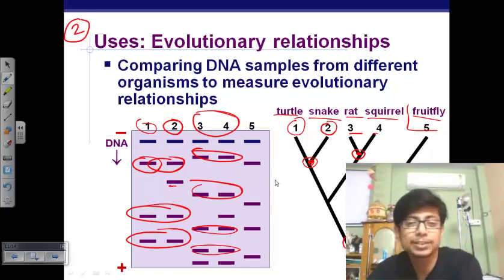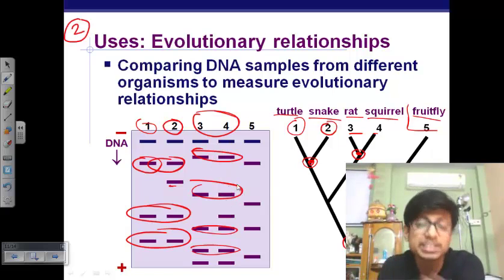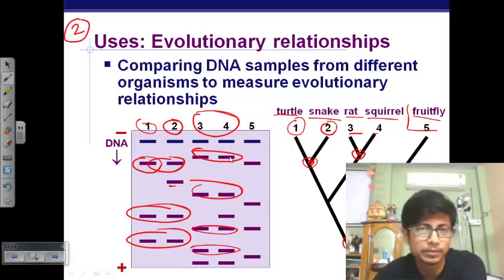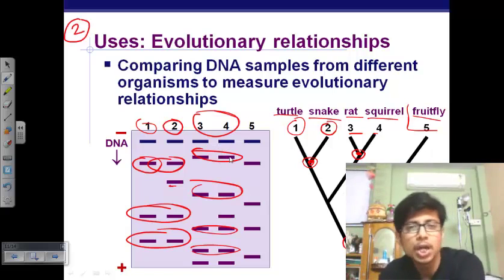But again, this is not that easy. Though it was given in a very simple way, actually doing this is very difficult. I mean, using 16S RNA samples and all these things, it's kind of tedious, and we cannot do this manually on our own. There is software out there with very tough algorithms going on to actually detect what's going on and to give us the idea whether it is related or not.